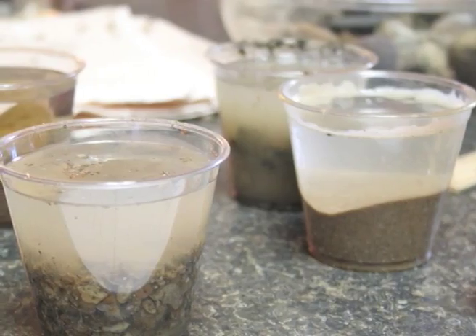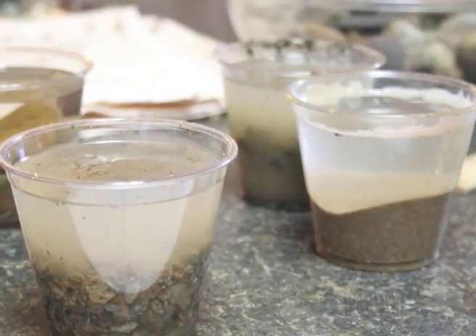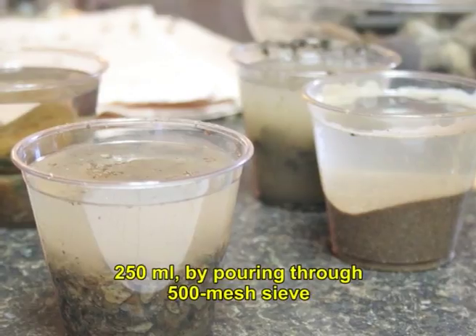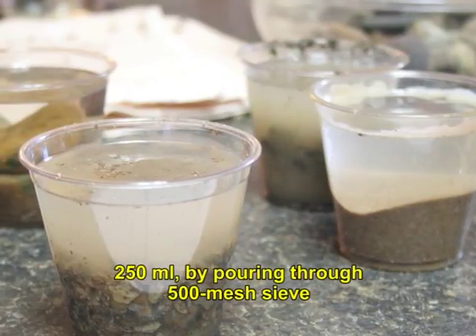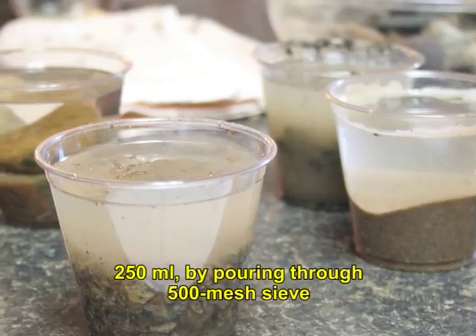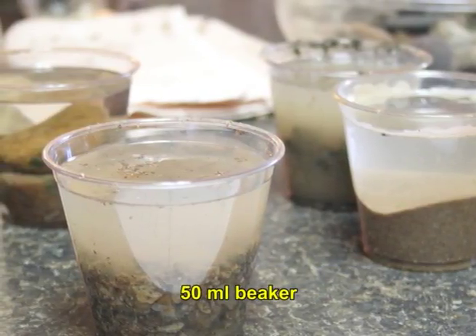This is followed by concentrating the contents of the 250 ml beaker by pouring through a 500 mesh sieve and backwashing with a small quantity of water into a counting dish or 50 ml beaker.